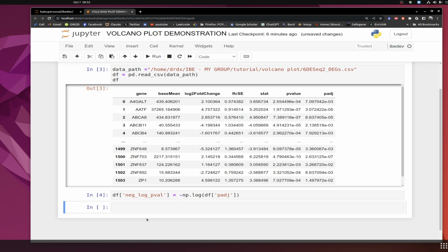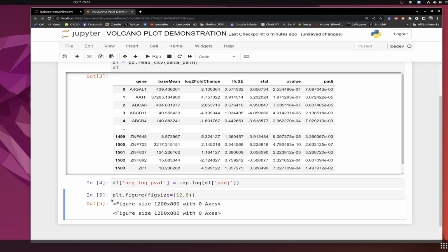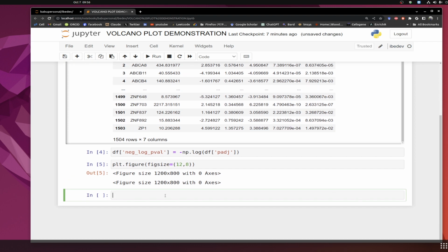And the next part is that we initialize a figure. So plt is for matplotlib, if you remember from earlier. We want it to do these things, and figure size. We can set the figure size equal to 12, 8. That will be done, and then we start plotting our data. If I want to look at significant, non-significant, different levels of data, then you can do it this way. But one of our major interests is to look at the upregulated and downregulated data in here. You can always plot the non-significant data, but there is no need to write it up. Plot this data.